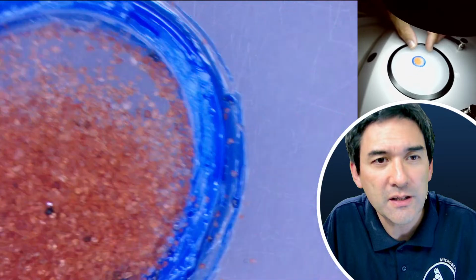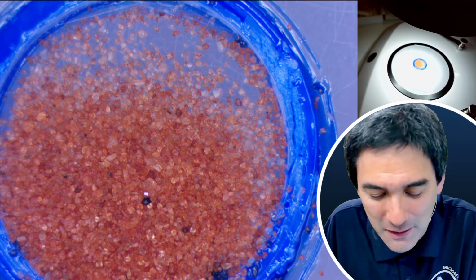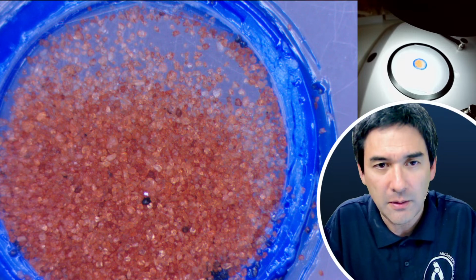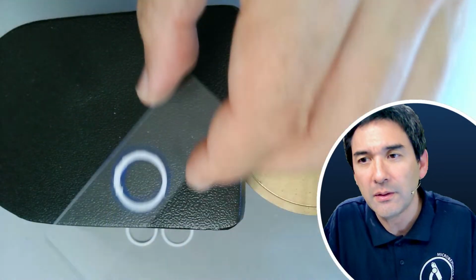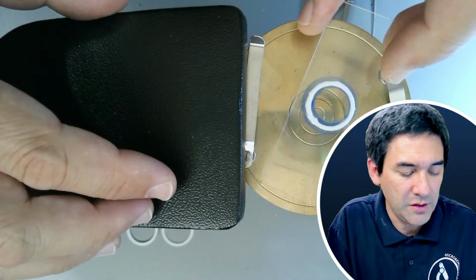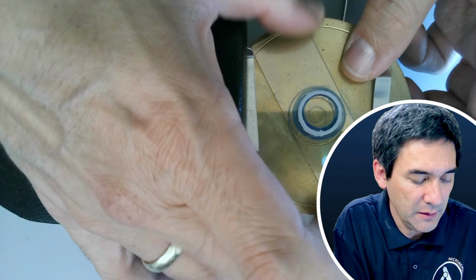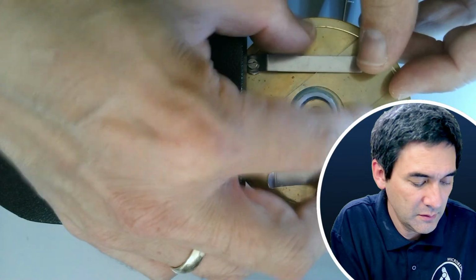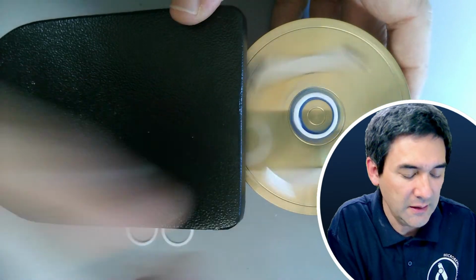And you know what? Why do we not try to make another slide? Maybe the more slides that we make, the better I become here. We can actually use maybe some of the slides that I already made before. Okay, so I'm going to go back to the desktop view. Again, it takes me a little bit of time here, and let's try this here. Okay, so I'm going to put it in here again, and here again. So let's get it centered again a little bit. It's not fully centered. It doesn't matter.